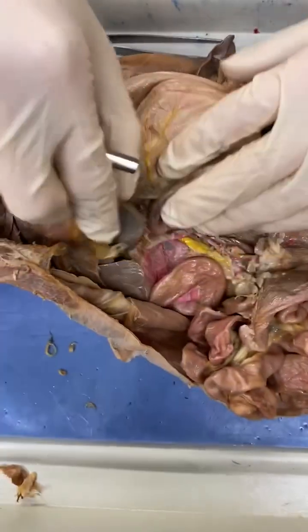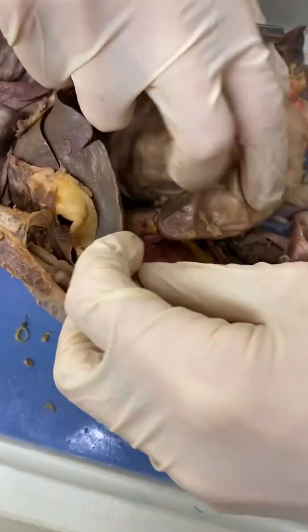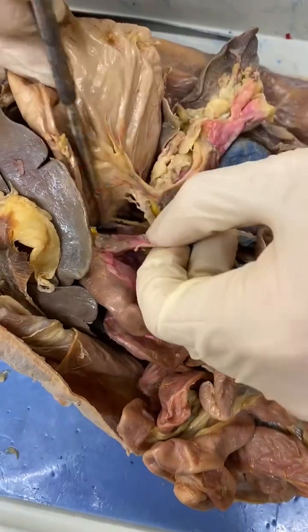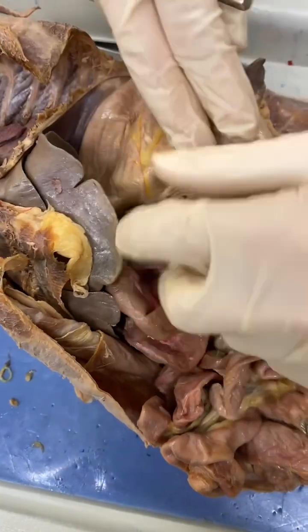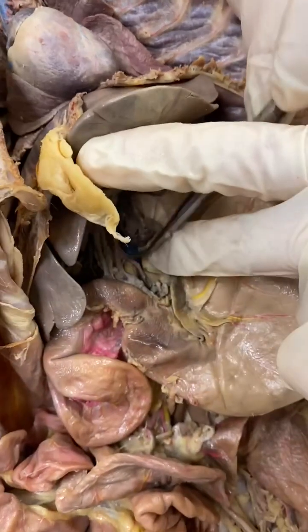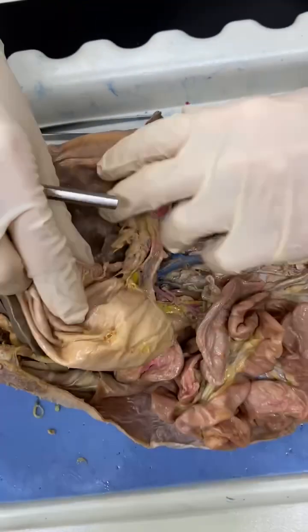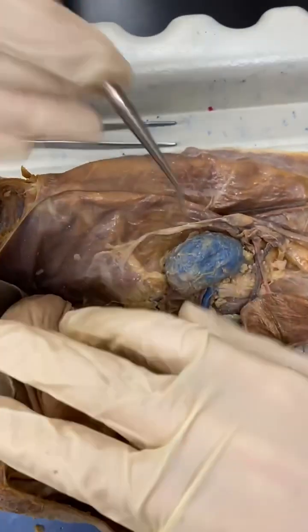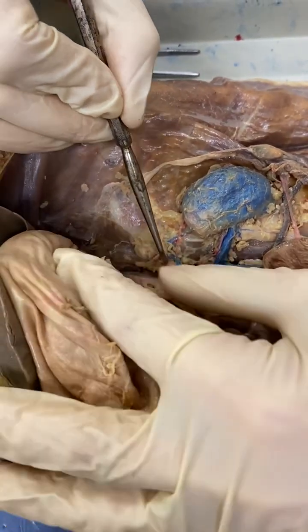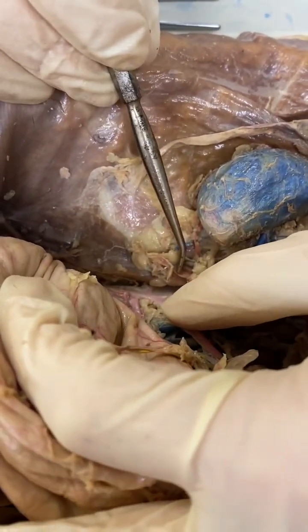Hepatic portal vein is this nice big yellow vessel. It goes all the way up. We can follow it going into the liver. The adrenolumbar artery and vein. Adrenolumbar, break it down: adrenal gland, and lumbar meaning back. We got the vein, and the artery is not as well defined, but you can kind of see some of the red vascular tissue back here.